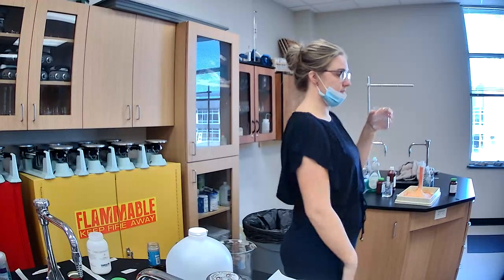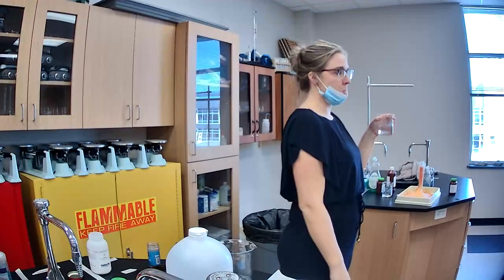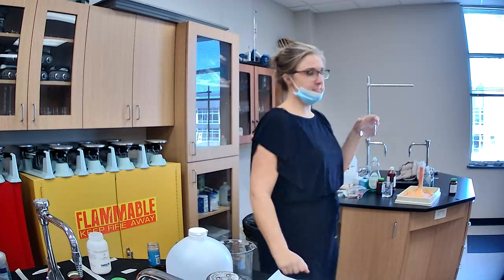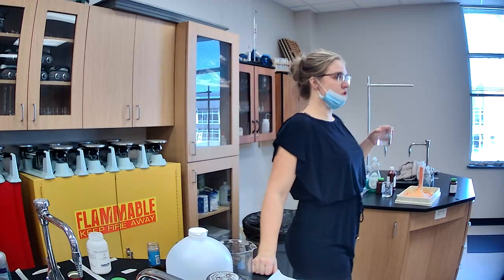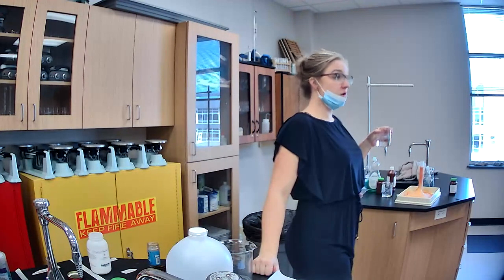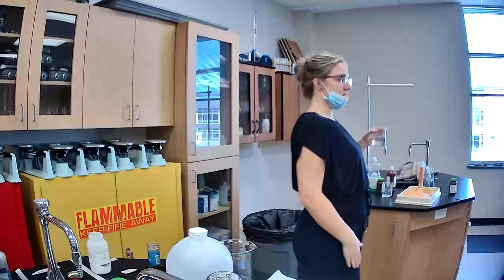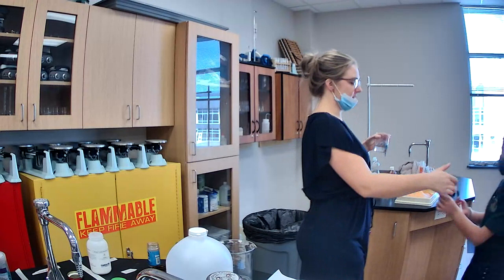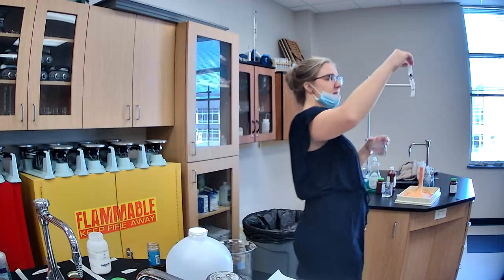So bring it to me when you're done. With the cup, that's how you made it dissolve, because that's actually what nail polish remover is made of. There's some that are pure acetone, so if your parents are having people over, don't try pouring acetone on their foam cups. Yeah, I had to learn that. All right, great job.